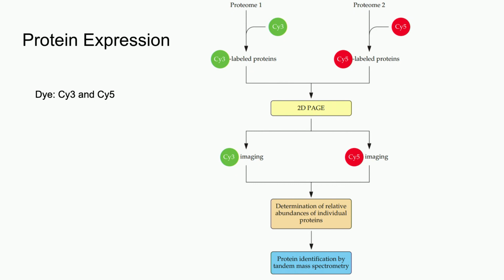The point of protein expression analysis is to determine changes in proteomes. Essentially how the quantity or presence of proteins changes for a certain disease. Now, an example could be a researcher who may be interested in comparing the proteome of a healthy cell or a cell with induced cancer. The before and after proteomes will be labeled and undergo 2D electrophoresis as described before. One way to differentiate the proteomes is dye. Cy3 and Cy5 are two dyes that can be added to the two proteomes separately and allow for comparison. Visual analysis of the 2D electrophoresis plate can show differences in protein presence and expression.